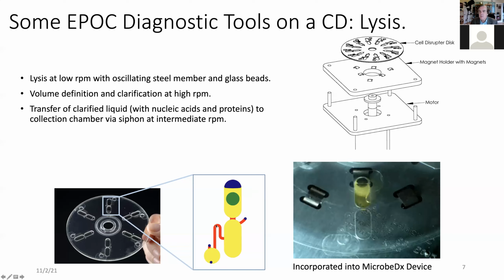So what we're going to do is this unit is put on top of a platform. These are all of these units, and that's a magnetic holder with magnets. You see these magnets here distributed in a certain way. What these magnets are doing is, when this is rotating over the magnets, they are attracted to the permanent magnet underneath. So this disc that's movable up and down, so this disc can move like this, it's attracted at this point to this permanent magnet underneath the platform, right?